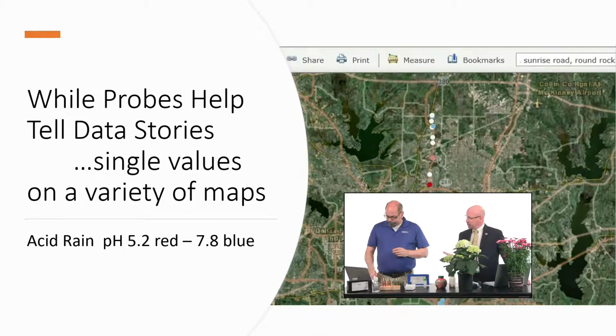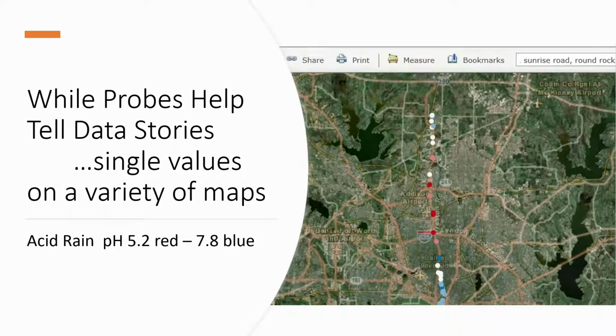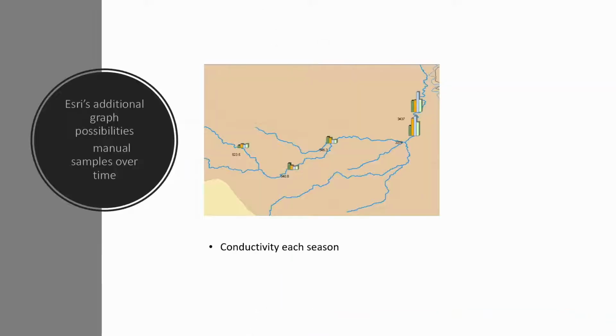Yep. Using the GPS within your phone, dropping that into a standard map with the help of Esri, and we're able to take a look at this data. Right. And here we see some different values too. Yeah, anytime you see two big highways cross, all that carbon dioxide coming out from cars is going into the water from the rain, and it's causing the water to become a little more acidic. And in areas where there's more city and more green, you see that it's less acidic. It's more basic, or more even towards neutral, I'd say, the blue kinds of areas.